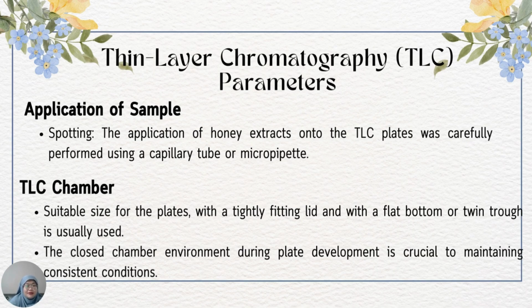For the chamber, we should choose a suitable size for the plates with a tightly fitting lid, and a flat bottom or twin trough is usually used. And then it should be a closed chamber environment because it would maintain consistent conditions.